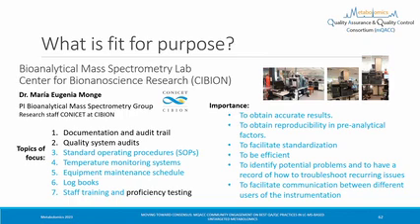And we'll see in larger organizations that's not the case, and auditing exactly who touched what becomes more procedurally important. And similarly, proficiency testing, that's an interesting one. That's when you go into the lab and make sure someone knows exactly what they're doing by some pre-planned mechanism. And I know you as a PI are doing that day to day, right? But it's not really considered proficiency testing as such, okay?